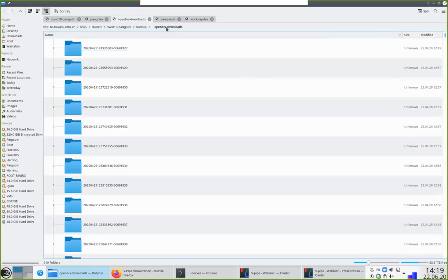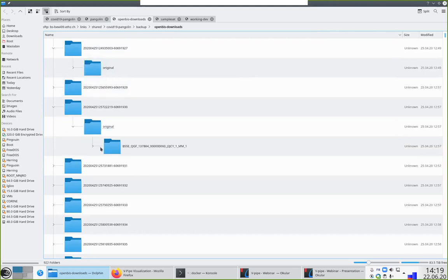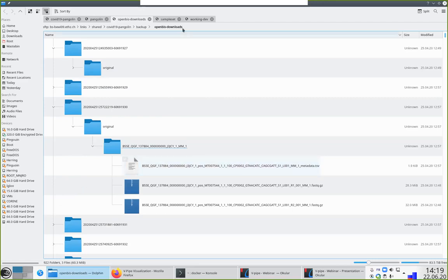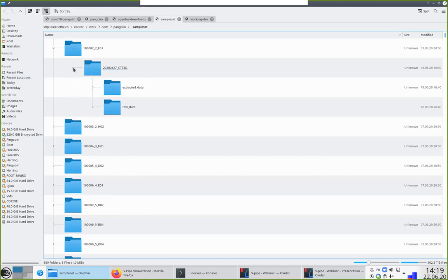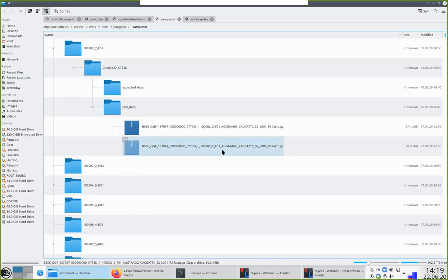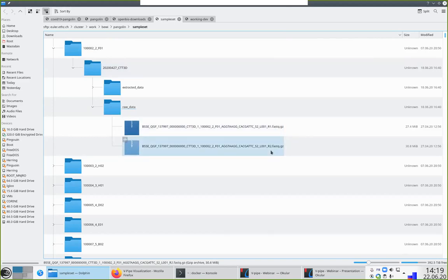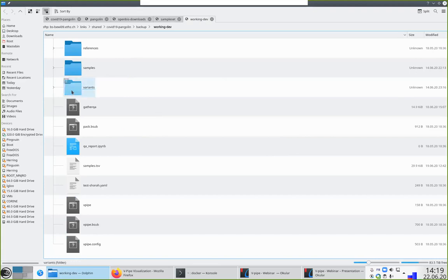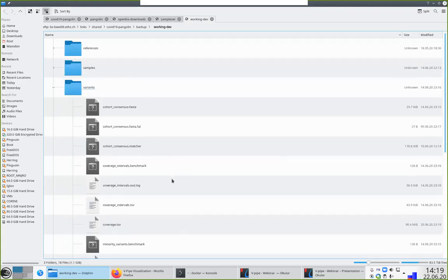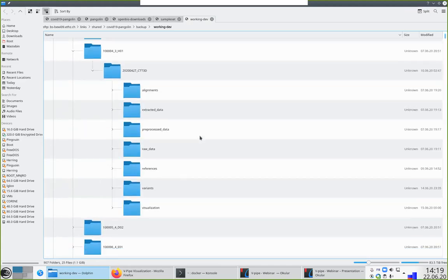In more detail, this is the kind of data we obtain from the OpenBIS repository. We have scripts using the official API that automatically arrange data into the structure we need: samples, then batches in which samples were treated, then inside the two paired files kept together with R1 and R2. After running vPipe, we obtain cohort consensus sequences, and for each sample: alignments, the reference uploaded to GISAID, visualizations, and other information about variants.